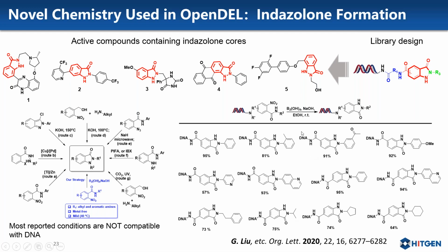So you can see that the reactions are quite diverse. Either the aromatic ring or the aliphatic ring can be tolerated to get this core structure constructed into the libraries. So this library is also in the OpenDEL collections.